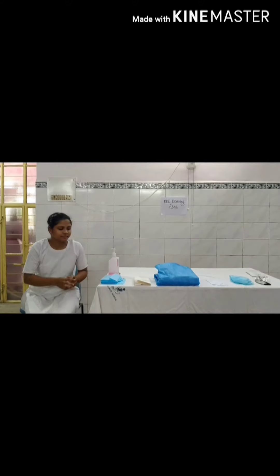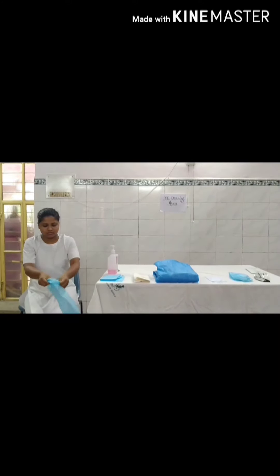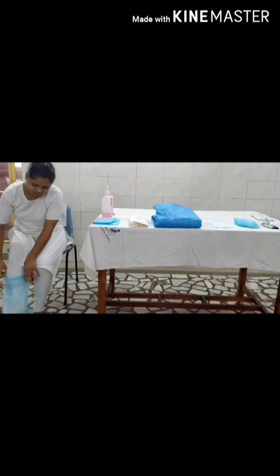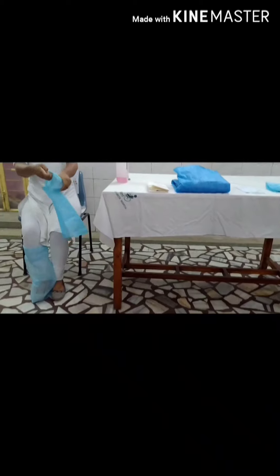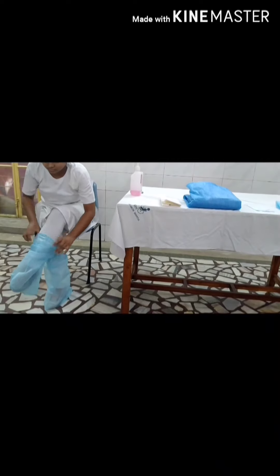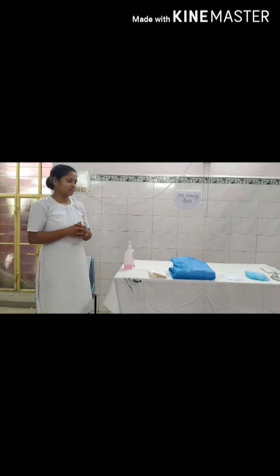Sit on the chair and wear shoe cover. Then again sanitize your hands.